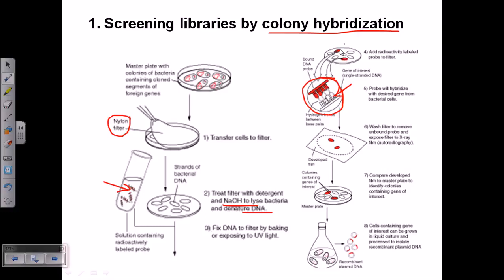So proper binding is done. After that we go through several washing steps which will wash away the unbound parts, and we also need to fix this attachment via UV cross-linking. Here I forgot to mention, UV cross-linking is required for fixing these cells onto the nylon membrane. Then we go through probe binding and several washing steps to remove the unwanted probe.